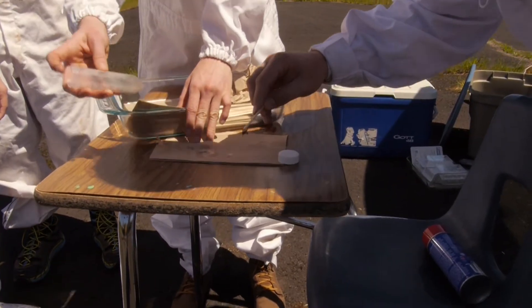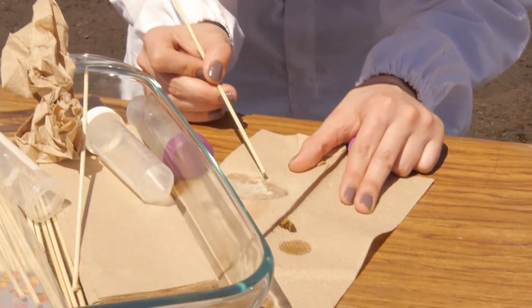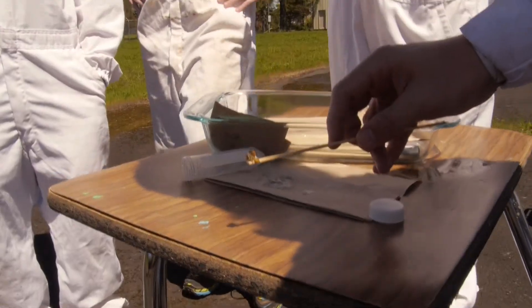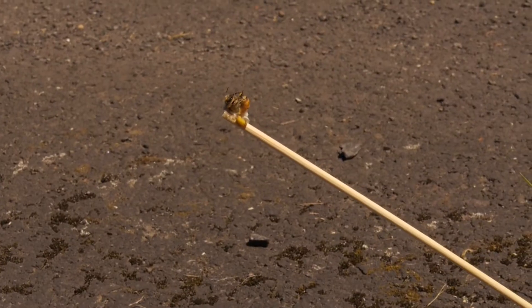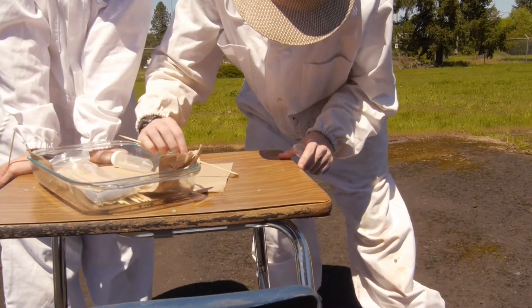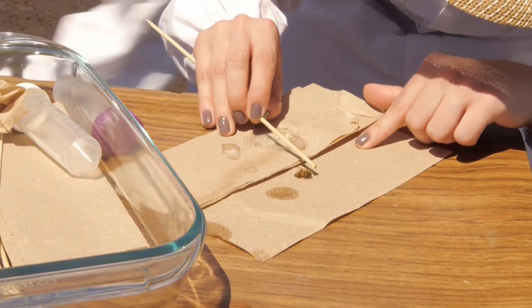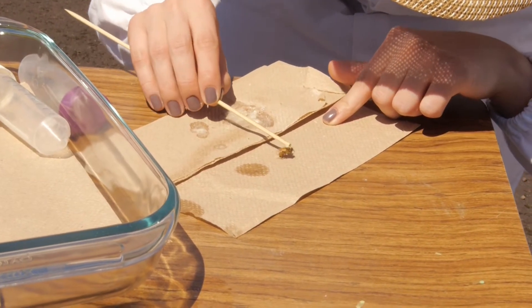This is spray adhesive, general purpose. You spray a little bit of it on a paper towel or something, let it reach a certain tackiness, then put just a tiny little dot on the end of the stick. Then you stick it on the back of a bee, and the bee is just stuck there to the stick.